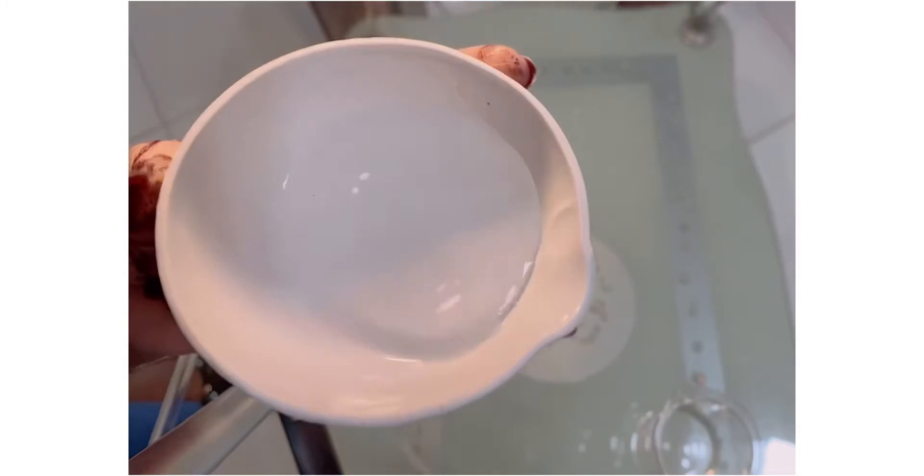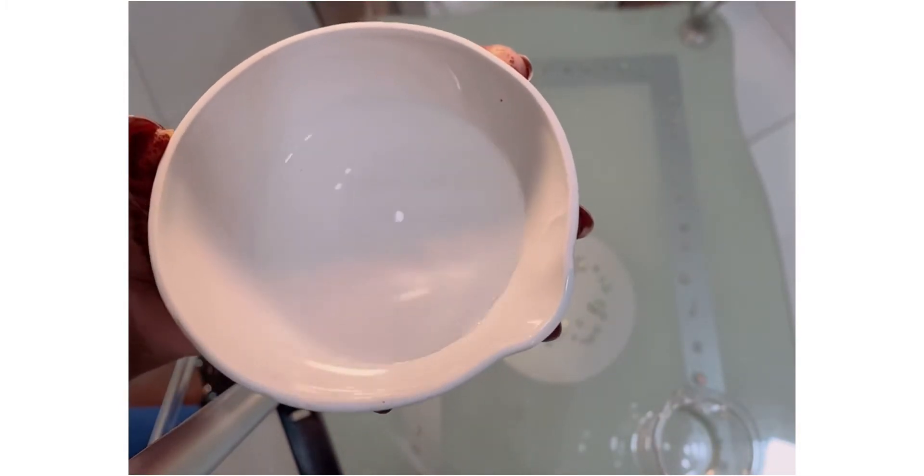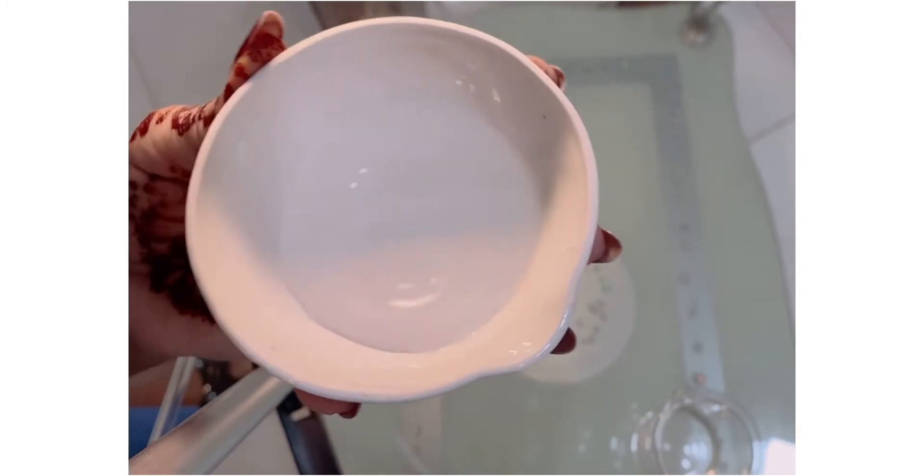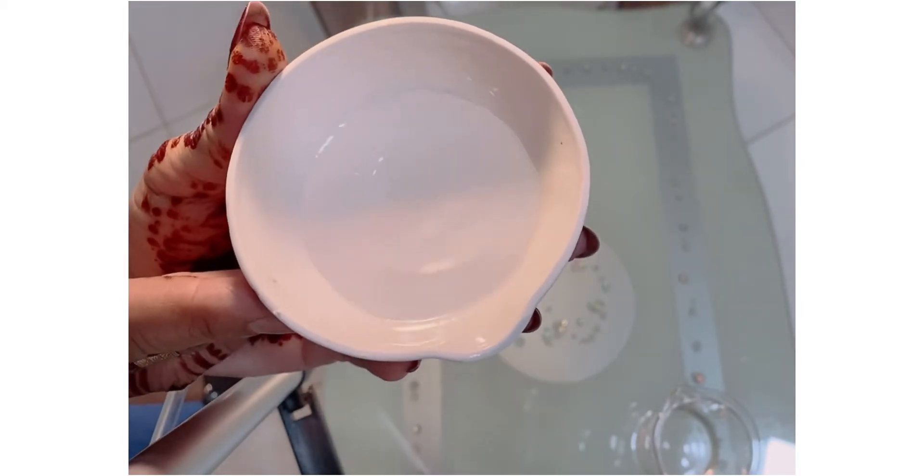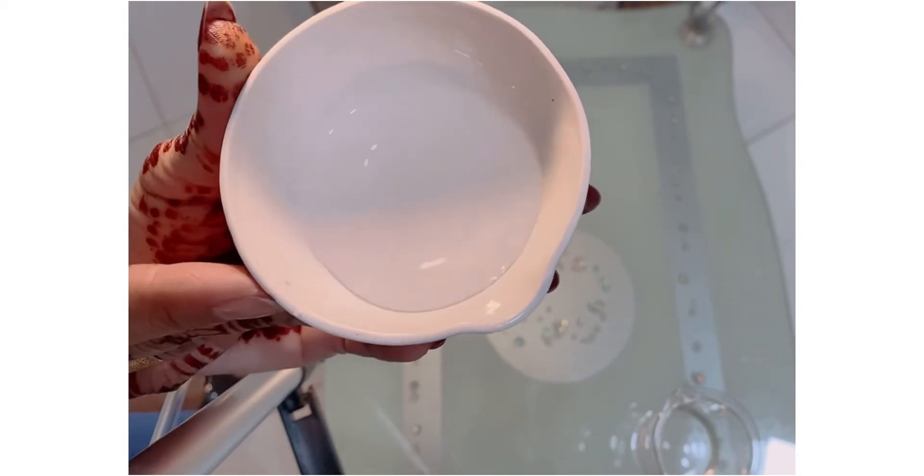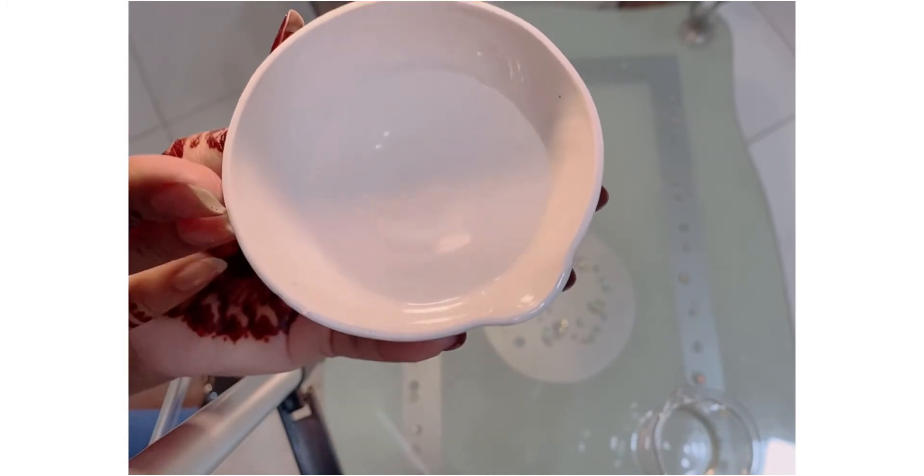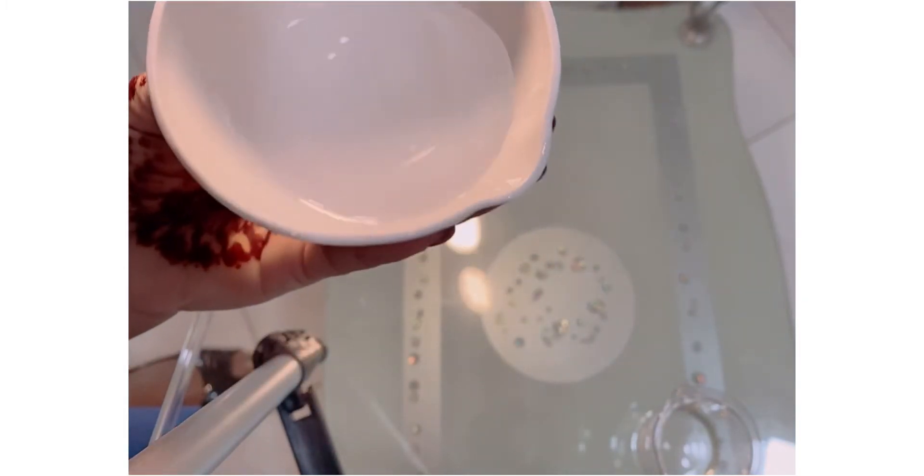Wider or huge dishes are used for large scale purposes, that is around 100 ml. These are used for the large scale, but for small scale processes we need mostly this in the labs.